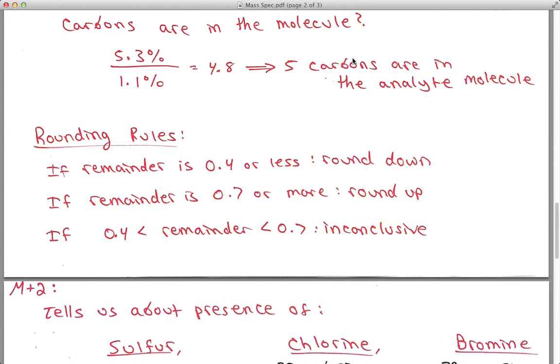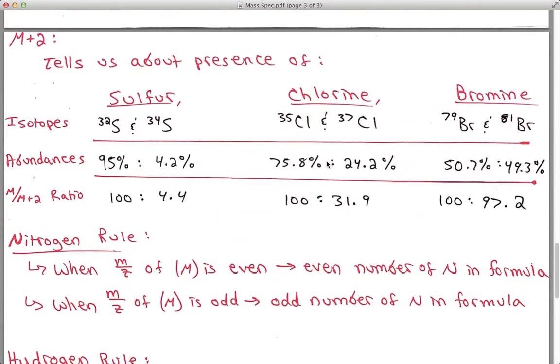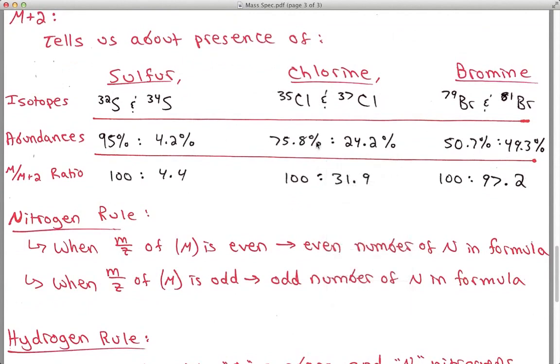This wouldn't necessarily be a lost cause, because let's say we suspect we have a substance that has 3 carbons. Well, if we yield 4.5, we know it has to have either 4 or 5 carbons, and although we don't know which one it has, we know that it can't be the substance we thought it was that has 3 carbons.